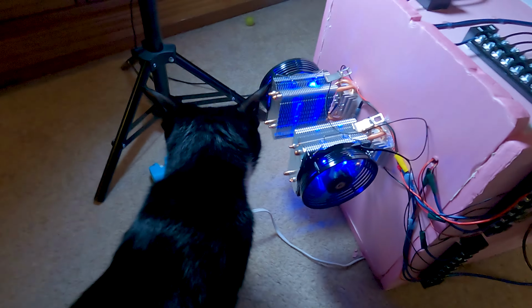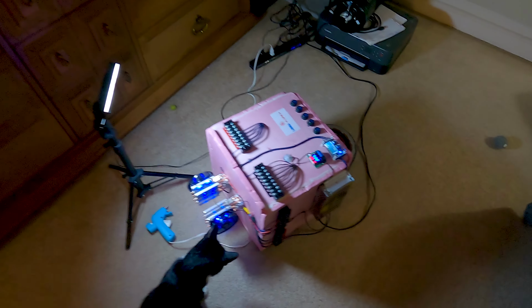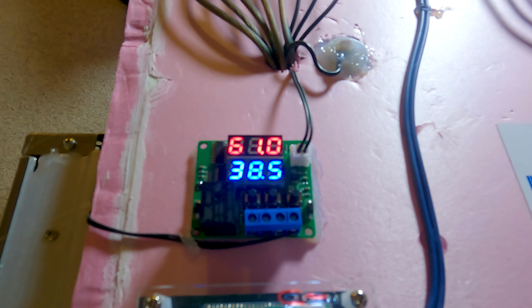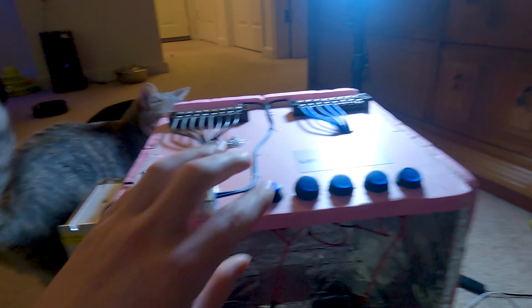Just finishing up the back here a little bit, but two Peltier modules with CPU coolers. And inside, so far, I just started it and it was at 65 degrees. I don't know what the bottom number is because 38 degrees is definitely not 65 Celsius. But it's nice and cool in here. And you can see number one is the 254 nanometer light underneath there. Very difficult to see. It's a mercury vapor lamp, and you can't see 254 anyway.